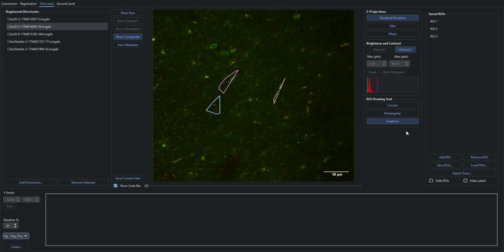But yeah, that's pretty much it. I think in general, this is very usable because in general, you want to export a trace and then analyze it yourself.